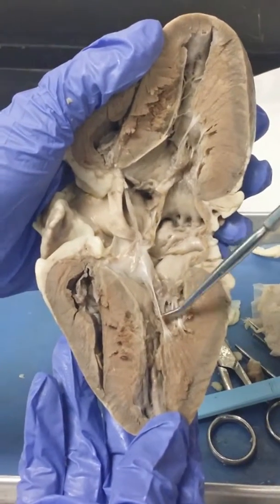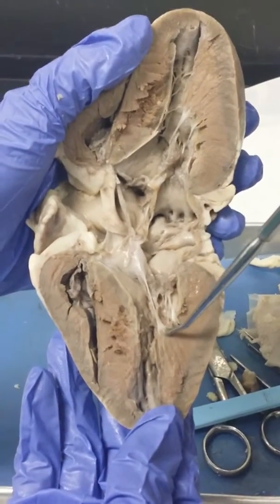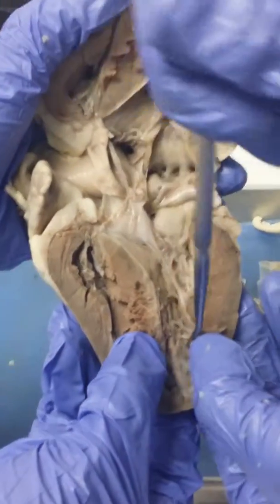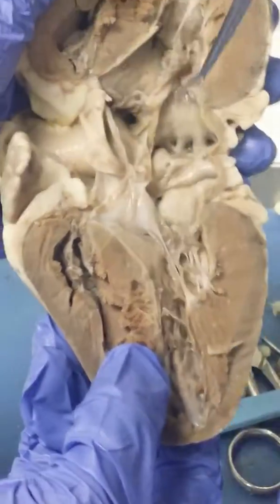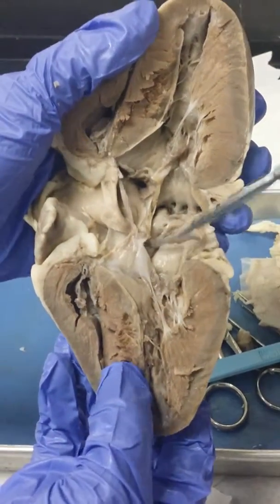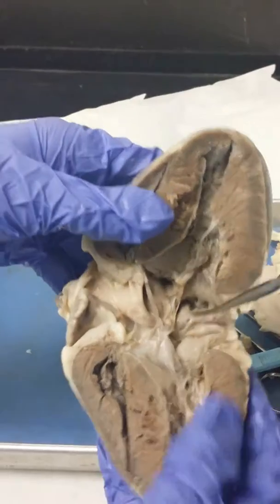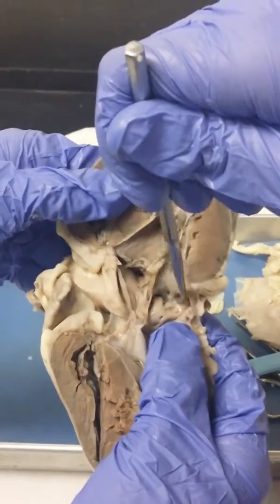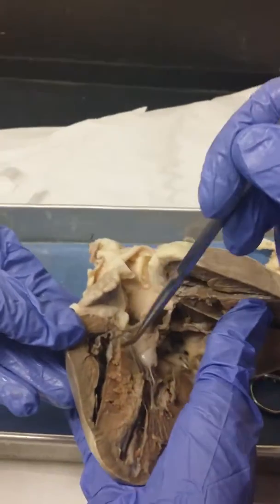For your left ventricle, these are the chordae tendineae, and right where they connect are the papillary muscles. On the inside you can kind of see the trabeculae carneae. And in the atria, the back part of it, that's your pectinate muscles.